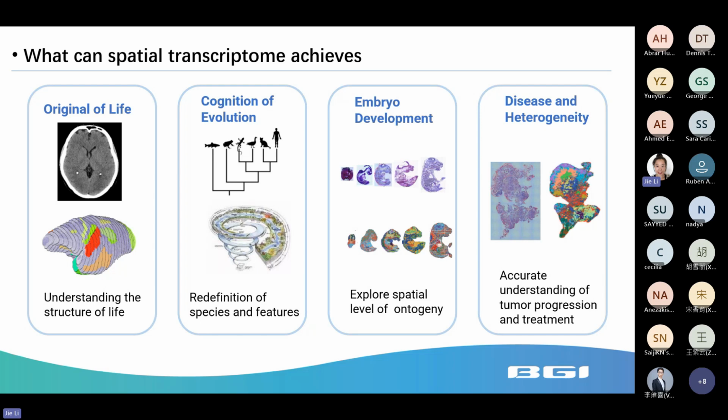Additionally, spatial omics integrates technologies and methods from various disciplinary fields, providing strong support for some complex life science issues, such as in clinical medicine. Spatial omics can assist in diagnosing and treating disease more accurately. For instance, by in situ detection of the patient's gene expression, it can provide a basis for future personalized treatment.